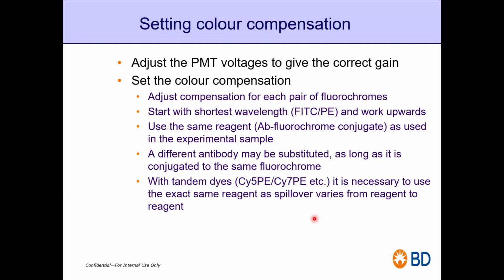And you have to adjust the PMT voltage to set the compensation. That we are going to do tomorrow. That's why I was telling you that setting up the PMT voltage is important. And once you adjust the PMT voltage, after that you can't change it.